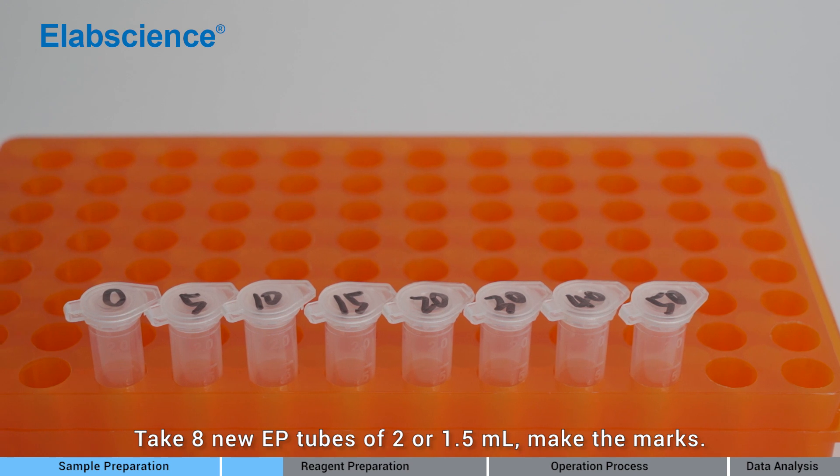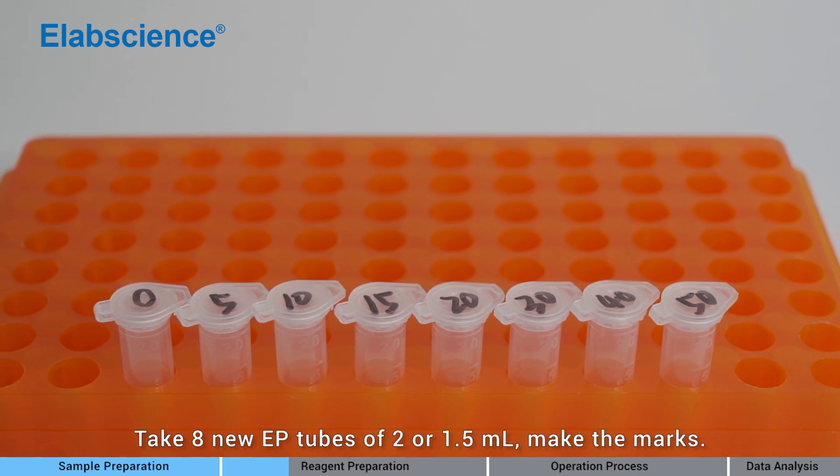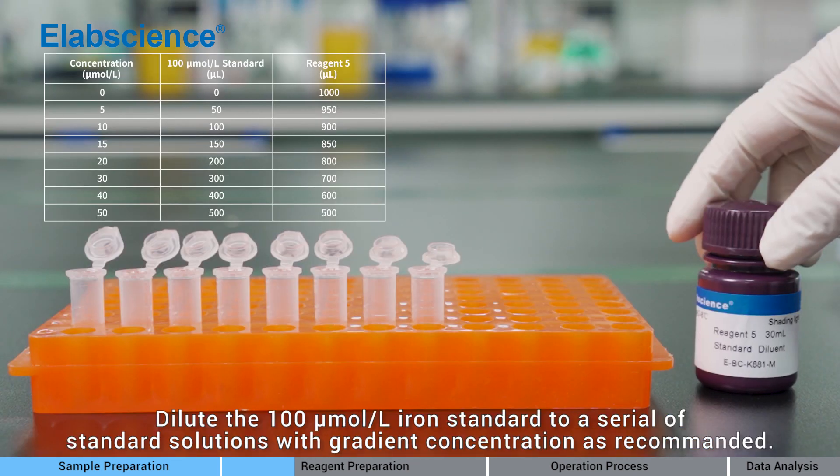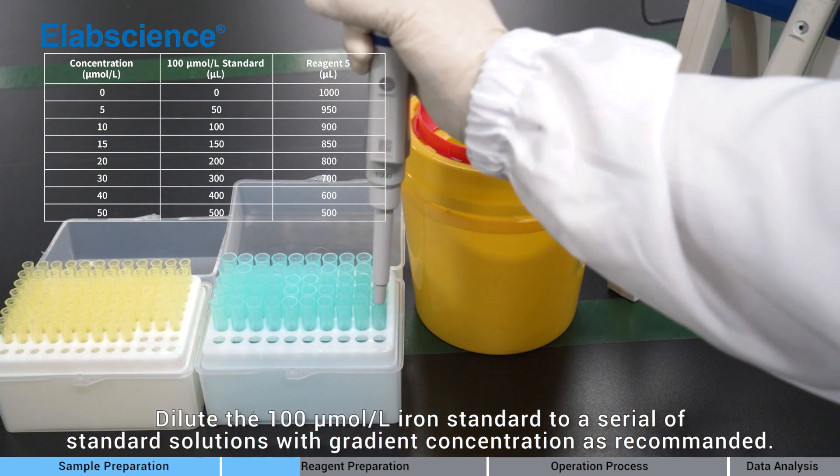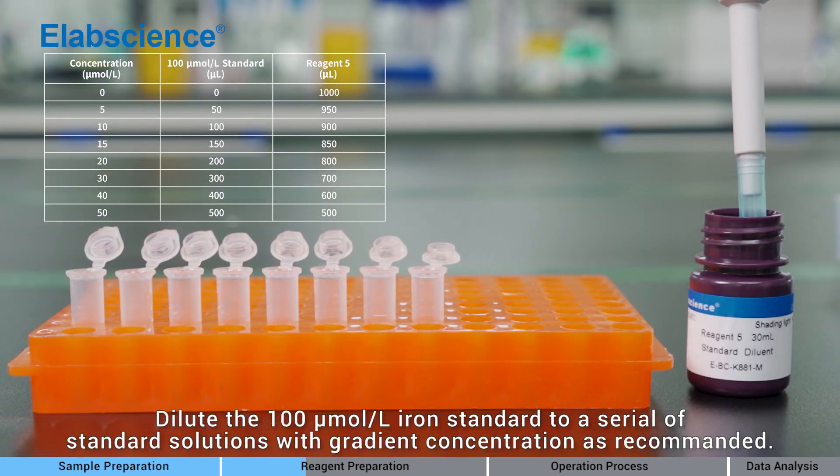Take 8 new EP tubes of 2 or 1.5 ml. Make the marks. Dilute the 100 micromolar per liter iron standard to a series of standard solutions with gradient concentration as recommended.